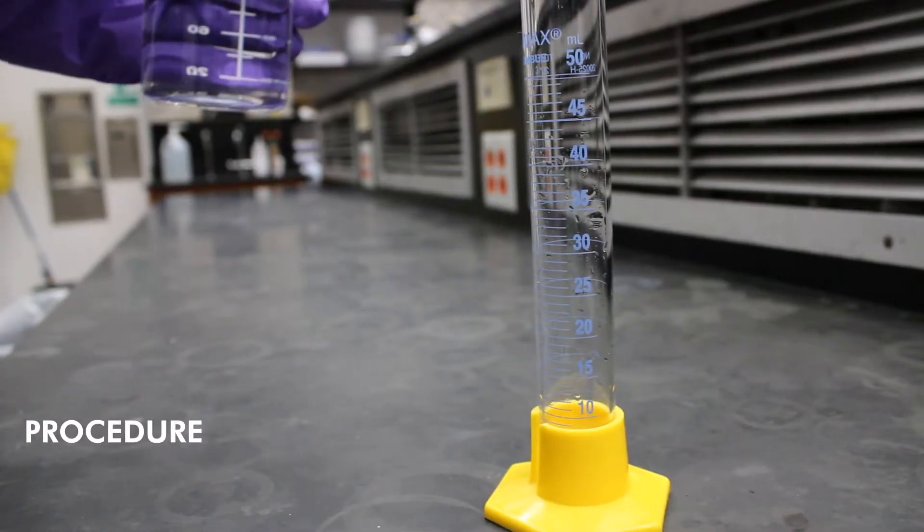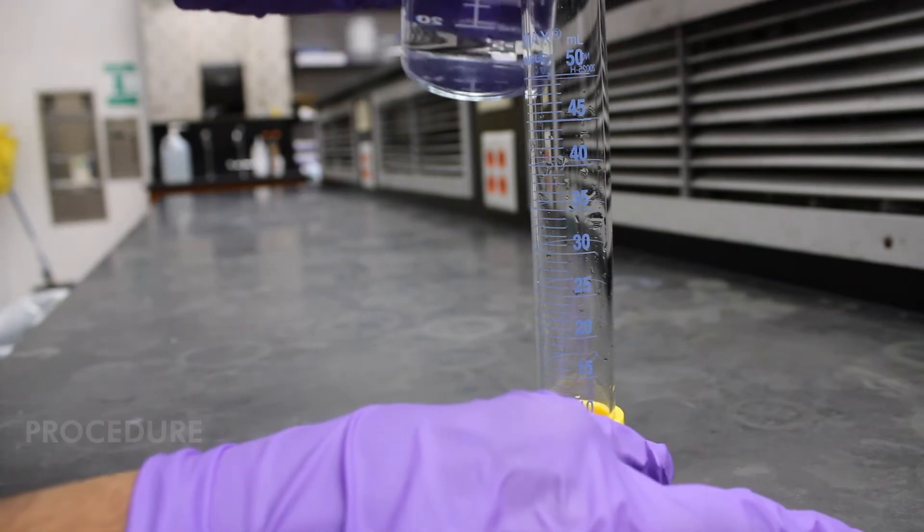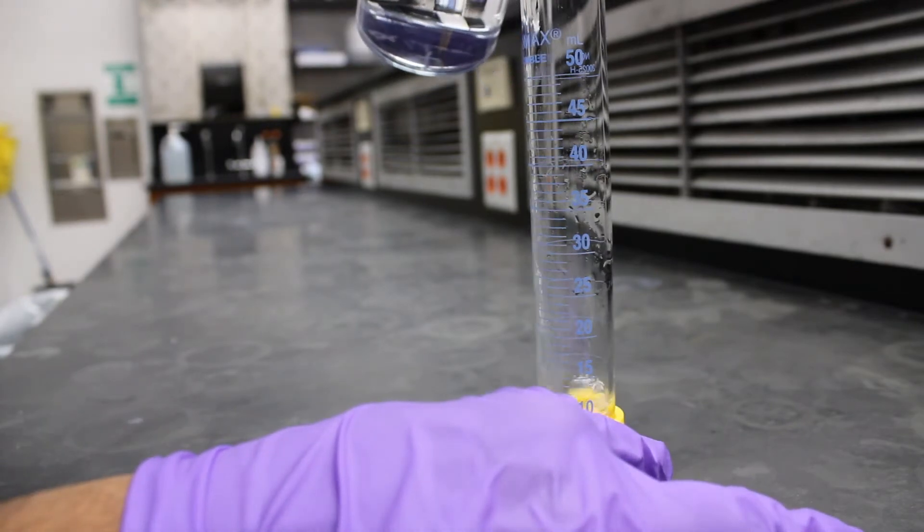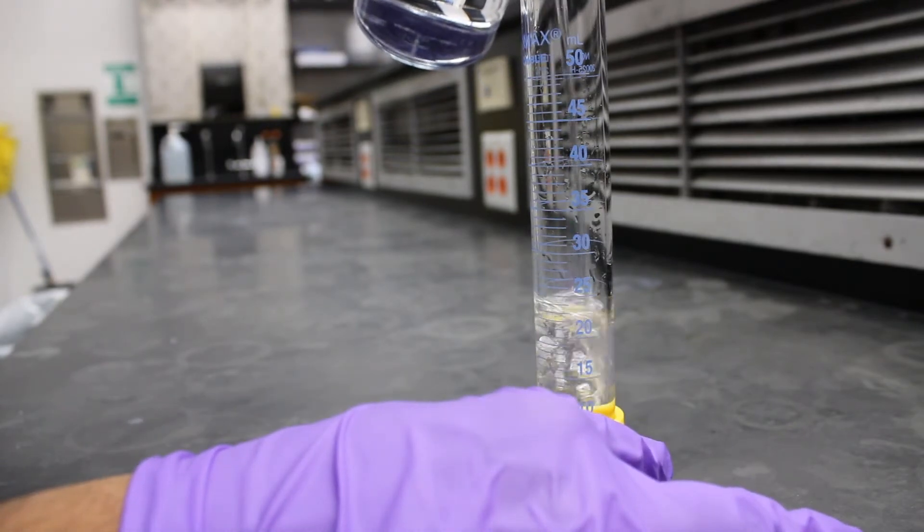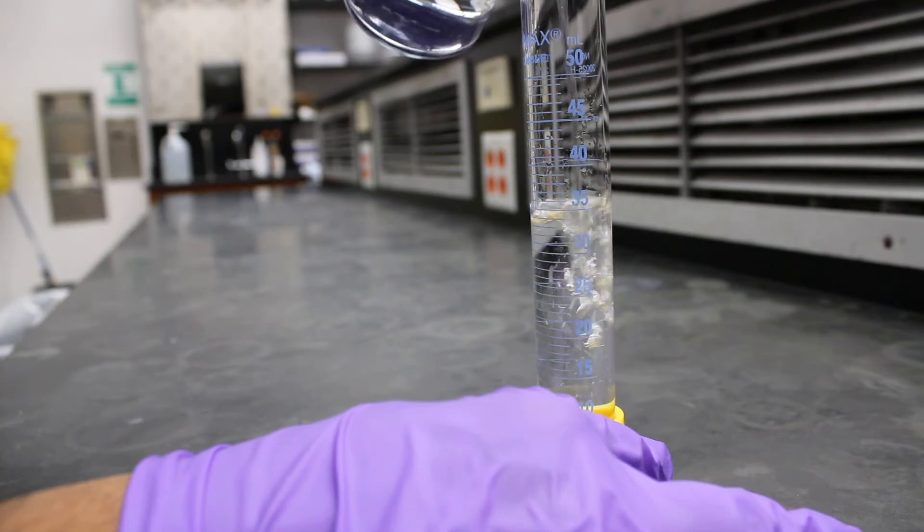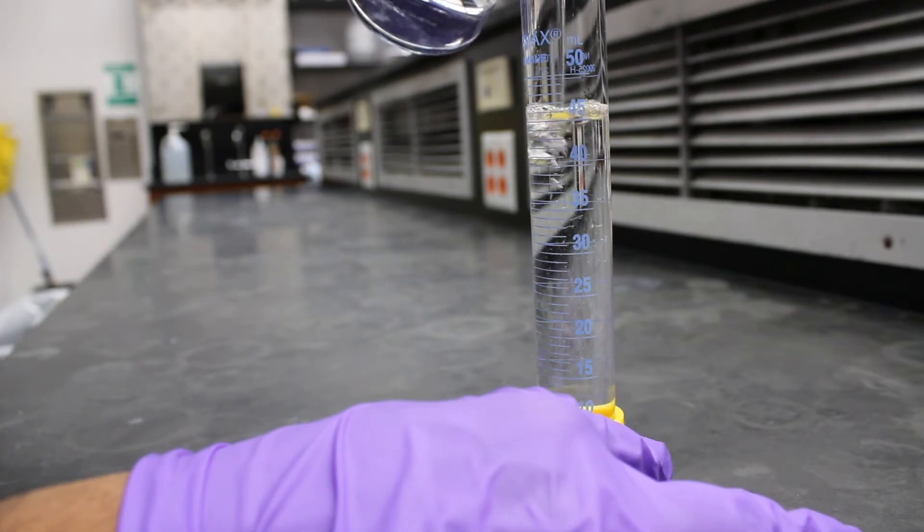Take citric acid and sodium bicarbonate from your TA. Measure 50 ml of DI water with the graduated cylinder and then pour it into your cleaned 150 ml beaker. When measuring the water, ensure that the lower meniscus of the water touches the 50 ml line.